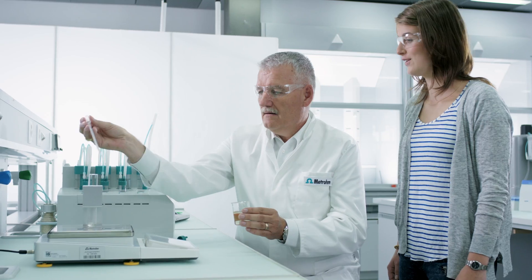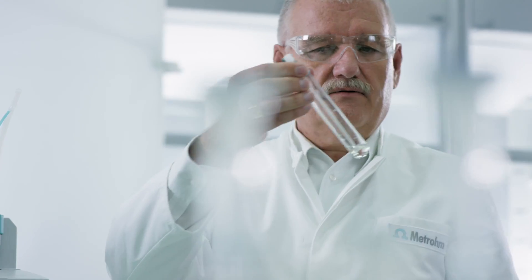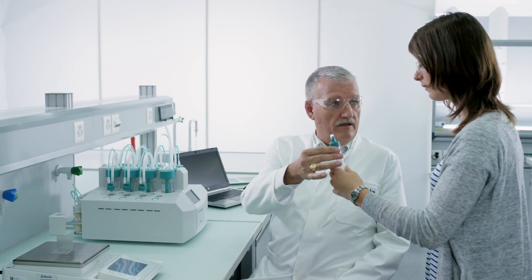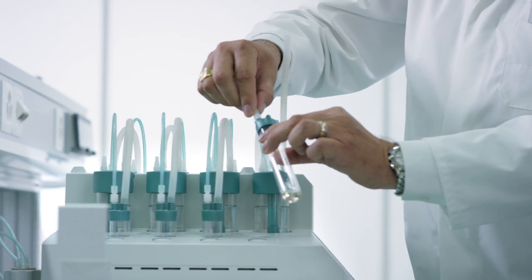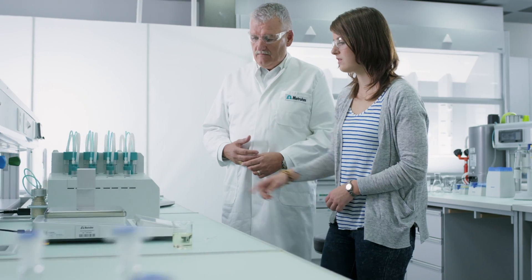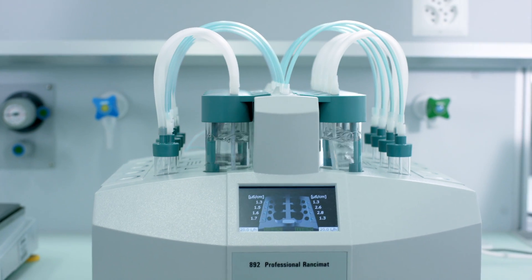Metrohm has always worked closely with its customers, and the Rancimat method is an outstanding example of this. Some 40 years ago, a customer approached Metrohm with an idea for a new way of testing the oxidation stability of fats and oils. This measurement is important for estimating the shelf life of foodstuffs, for example.